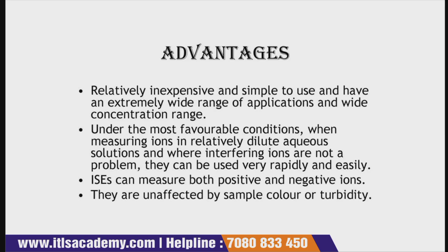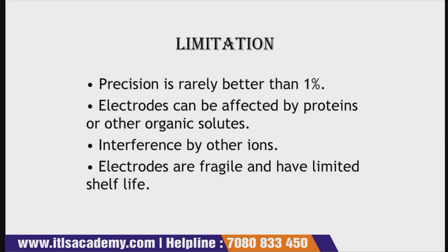Under the most favorable conditions, this technique is used where you want to measure ions in a relatively dilute aqueous solution, and it is a very rapid and easy method. They are unaffected by the sample color or turbidity.